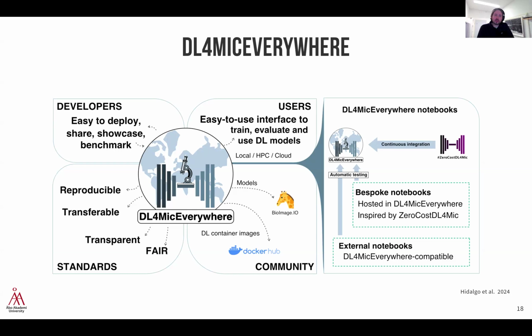So now, using this platform, you don't get the free resources provided by Google Colab anymore, but you have the freedom to very easily install those mini Python containers in order to use those tools on your own resources.